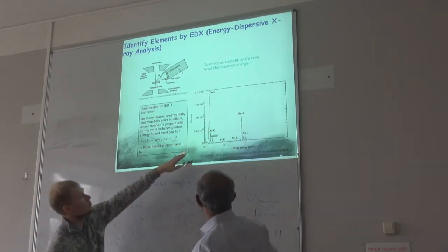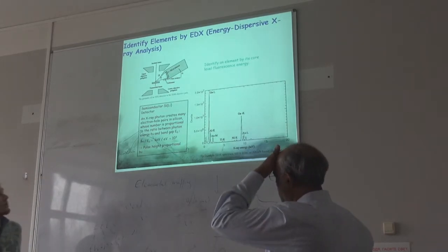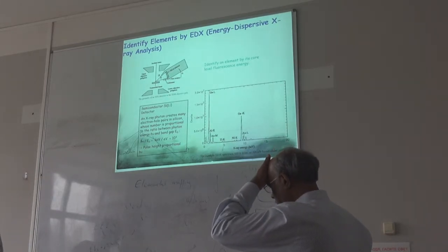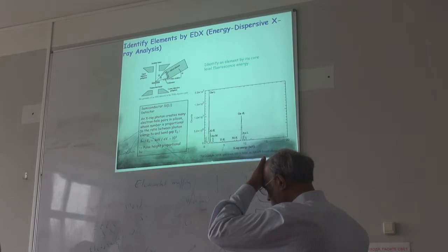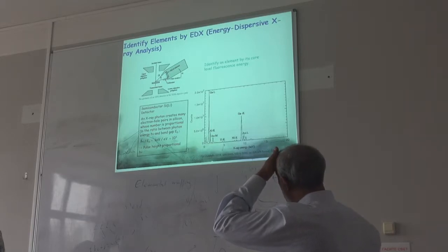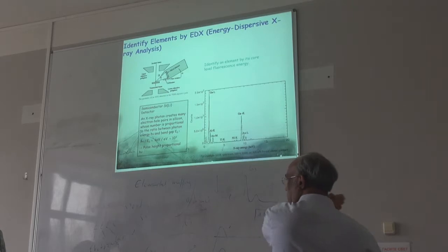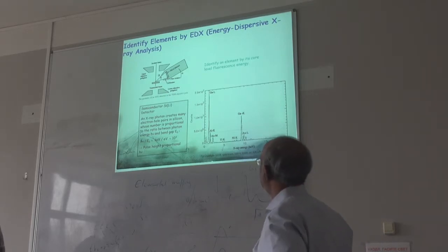And what about resolution? I think the resolution is really good. I cannot name the exact numbers. Except for hydrogen and lithium, the resolution is really amazing. You can identify boron, beryllium, any of those elements very easily.